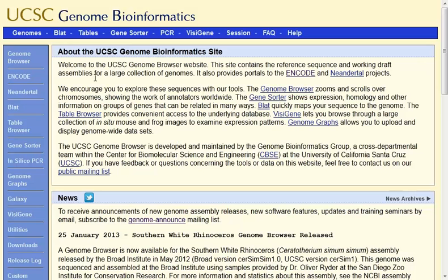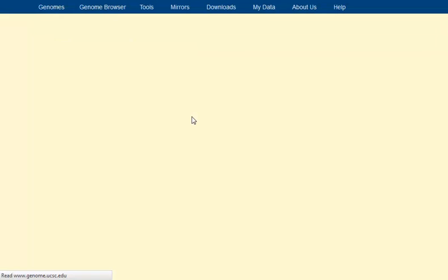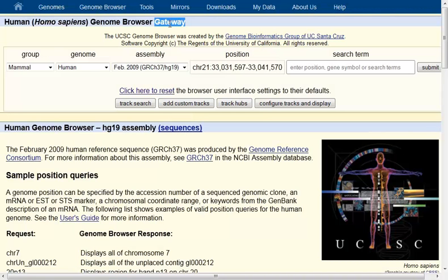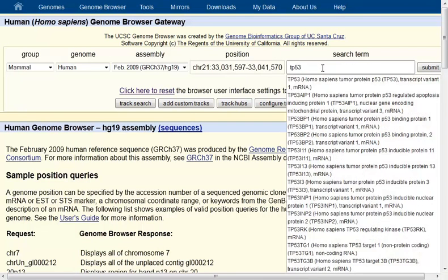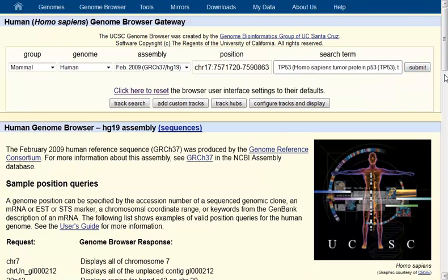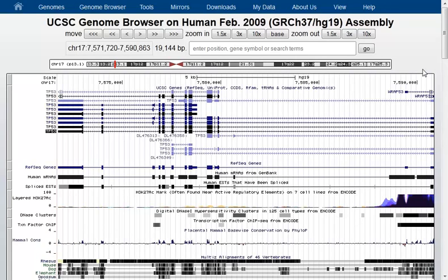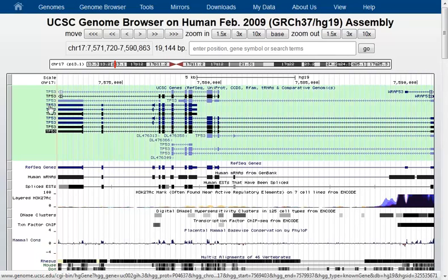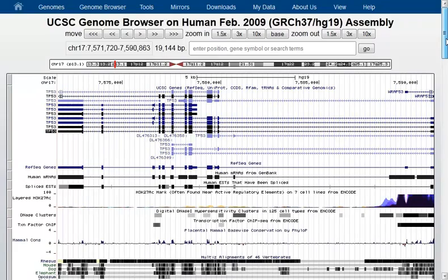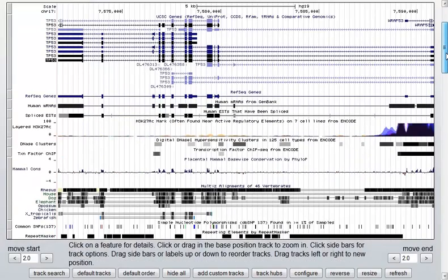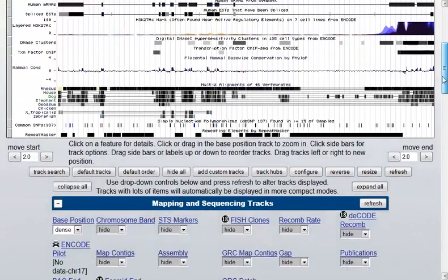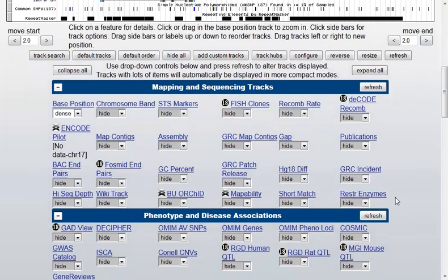I'm going to go to the UCSC Genome Browser and access the Genome Browser Gateway. Here we are in the Gateway. I'm going to do a quick search for a genomic region — TP53 — because it's a nice short query. I'll click Submit and go to that region in the Genome Browser. Here's the gene TP53; we can see we're in the right region. There's a lot of information available by default, but there's additional information in tracks that are turned off, and one of those tracks is Restriction Enzymes.